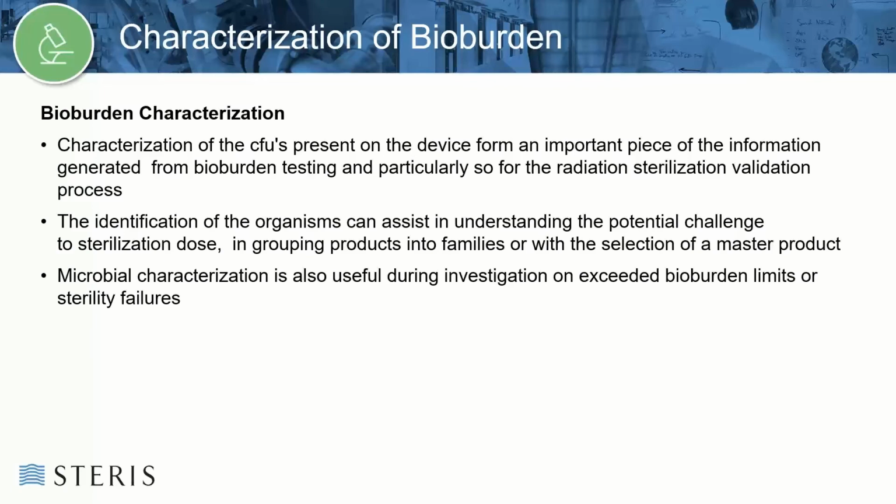The identification of the organisms can assist in understanding the potential challenge to sterilization dose, in grouping of products into families, or with the selection of a master product. Microbial characterization is also useful during investigation on exceeded bioburden limits or sterility failures.